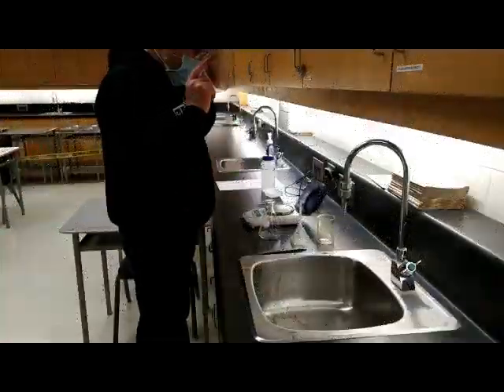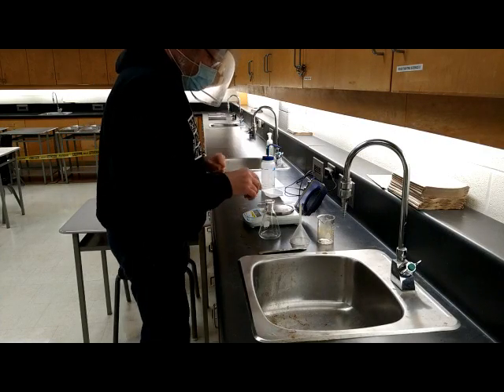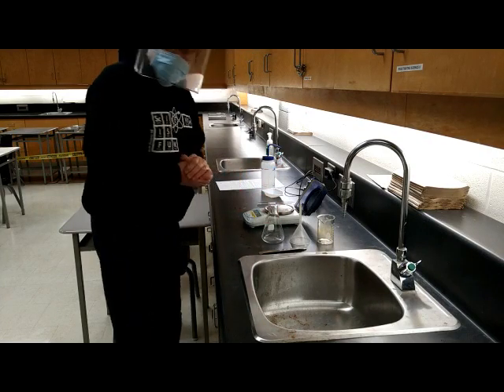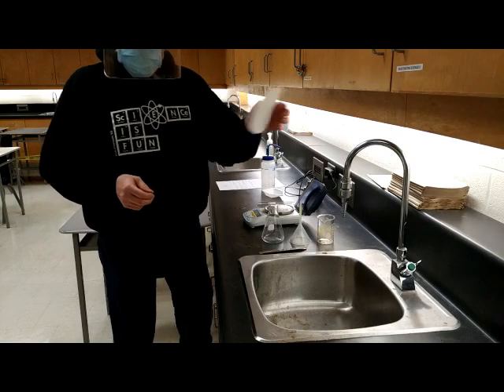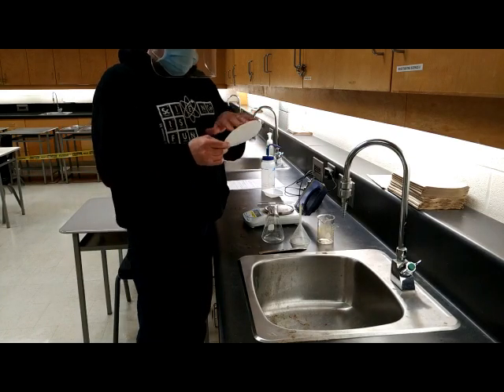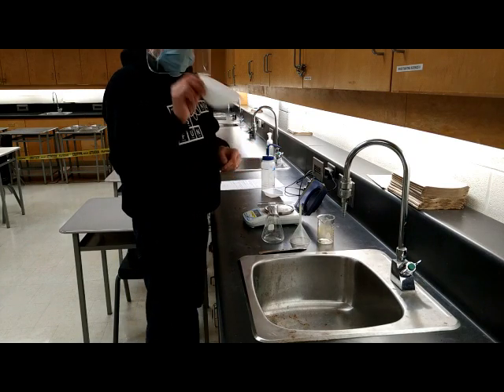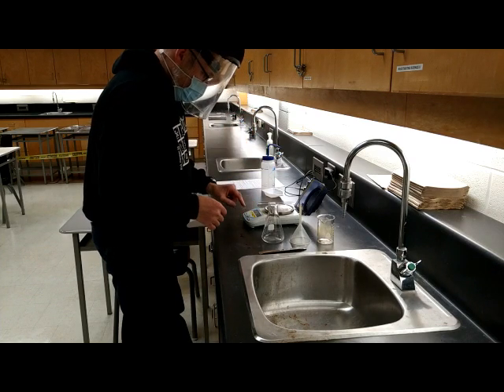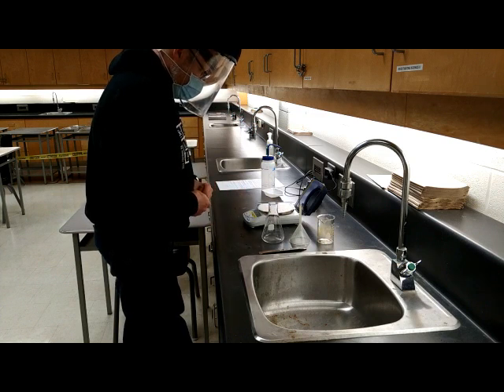There we go. So at this point, what we want to do, before we pour our material into the containers, we need to weigh the filter paper, because afterwards some of the material is going to be impregnated into this. In order to figure out exactly how much material we've got, we are going to need the mass of this thing to start with. So let me just re-zero this.